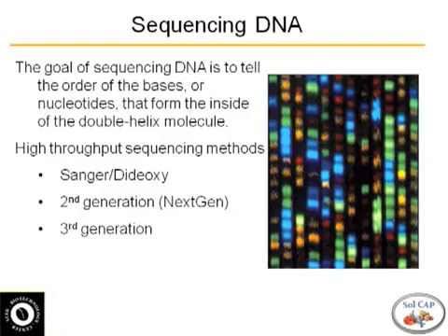So I'll call it the first generation technology, which is Sanger or dideoxy sequencing, that anything from 5 years ago and before has been done with for the most part, including a big part of the tomato genome. Then there's second generation, or what they call next generation sequencing, and I'm going to talk today about what we're calling third generation sequencing now.